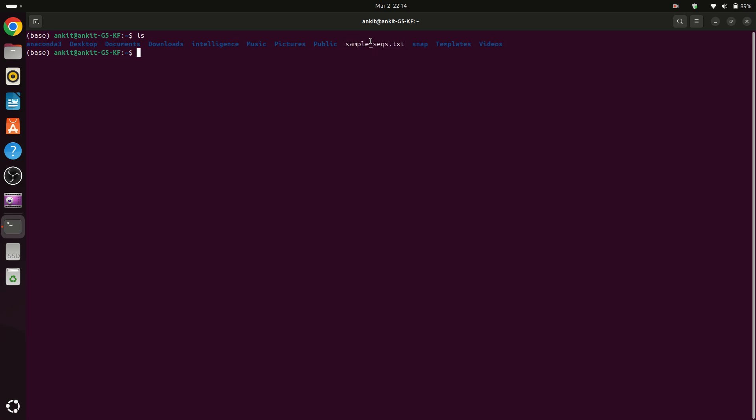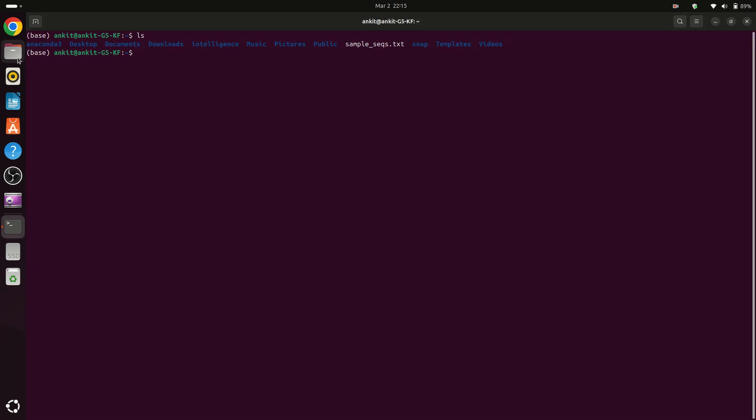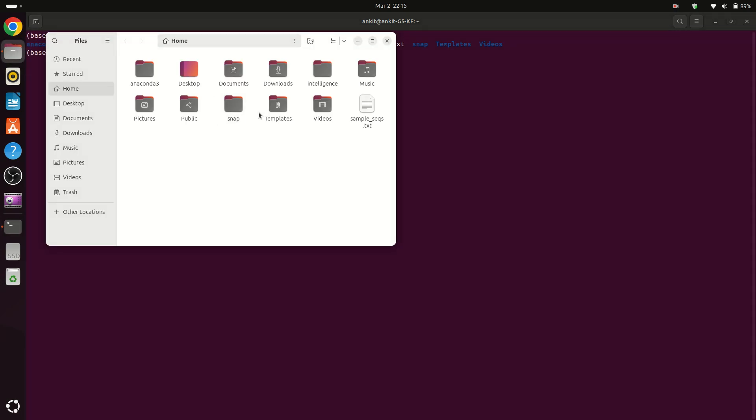We can see that I have a file here which is sample_sequences.txt. Actually this is a FASTA file so you can see here this is a FASTA file but the extension is txt.